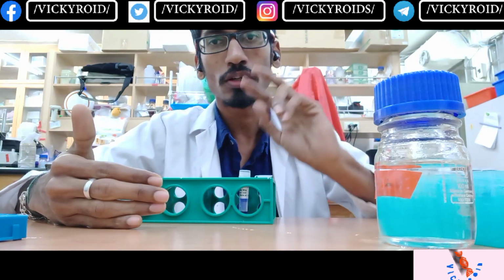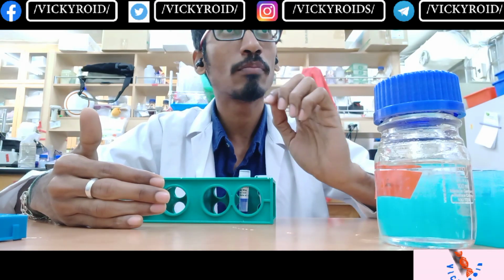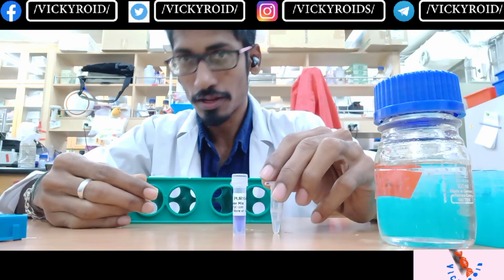I have already made the calculation. I'm going to do a 20 microliter reaction. You can fix the reaction volume based on your own convenience; people normally do 50 microliter or 25 microliter. Here I'm going to do a 20 microliter reaction. In a 20 microliter reaction, I'll be using 10 microliter of the master mix and 2 microliter of the M13 RAPD primer. This is only the forward primer.